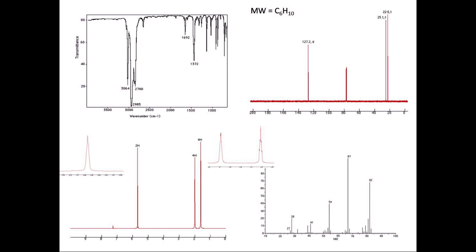Once you figure out your degrees of unsaturation, your next piece of data to look at is IR, which you can tell by looking at the units here. These wave numbers tell you the frequencies. What you want to be doing is looking from 500 to around 4,000 inverse centimeters, and all we're looking for is functional groups. That's it. I know there's always peaks up here around 3,000, 2,700. You don't want to confuse these for functional groups.